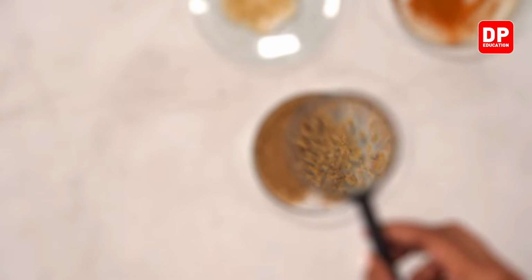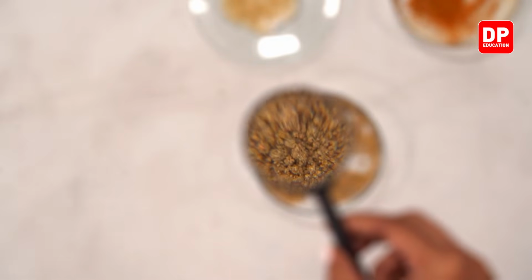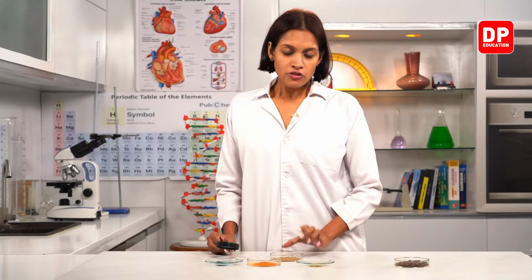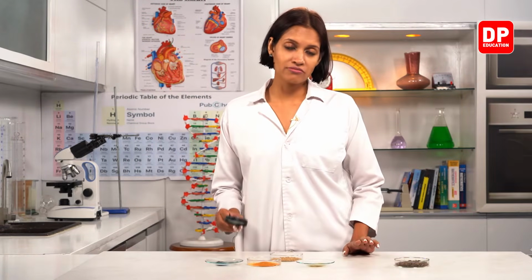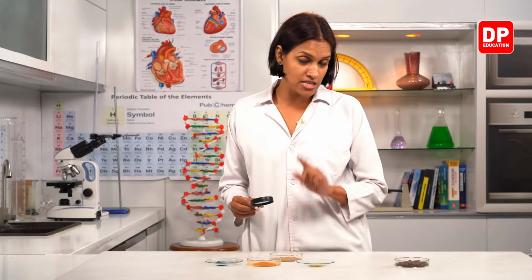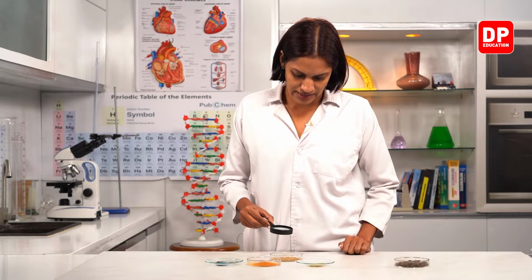There are different substances mixed with soil, so observe very carefully. These black color particles are not very clear when I don't use the hand lens. Only with the hand lens I can see them very clearly, right? Yeah, you all can see very clearly now.